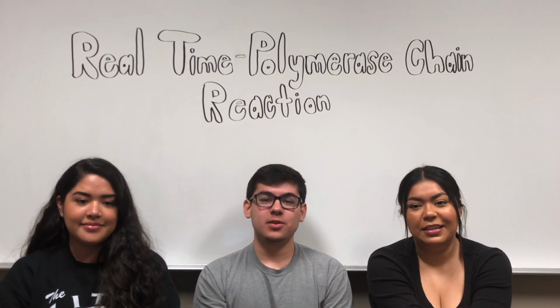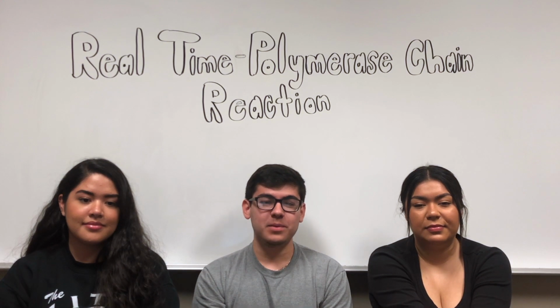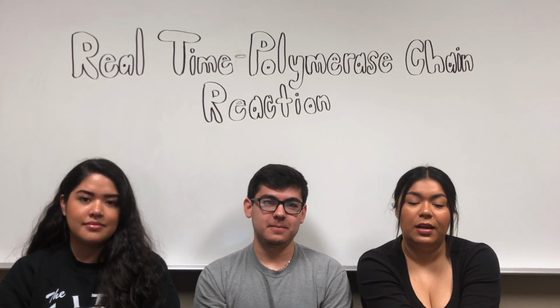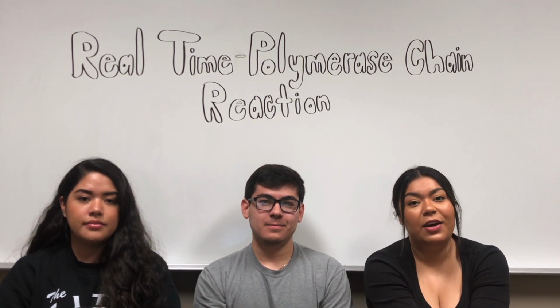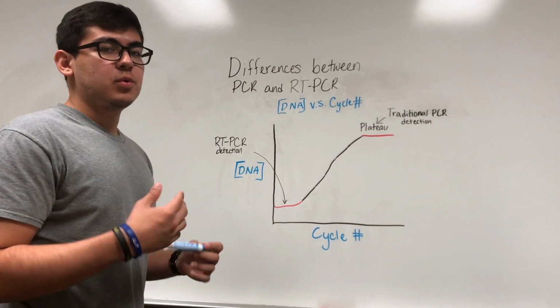And the objective for today is for students to familiarize themselves with the principle of real-time PCR, the steps of real-time PCR, and how they are all related. We will also be talking about the different applications for this technique and how they have evolved for today's use. Traditional PCR has evolved into real-time PCR, which is more commonly used.